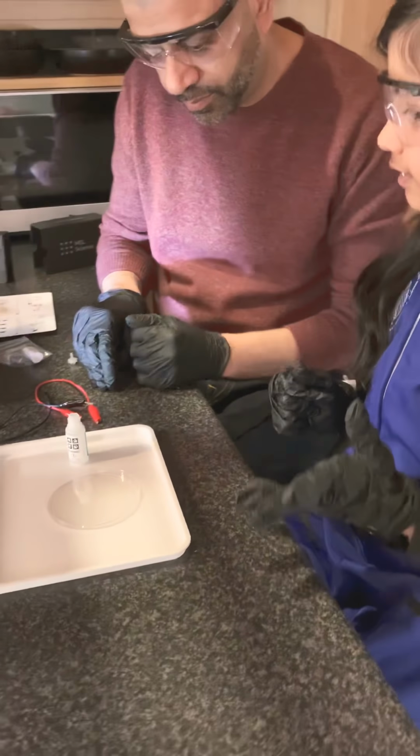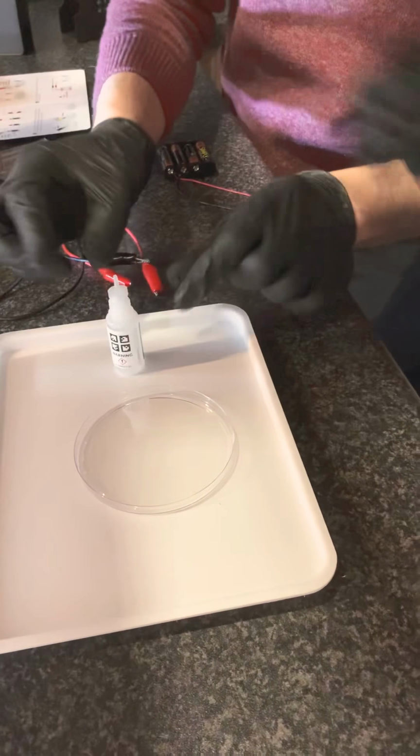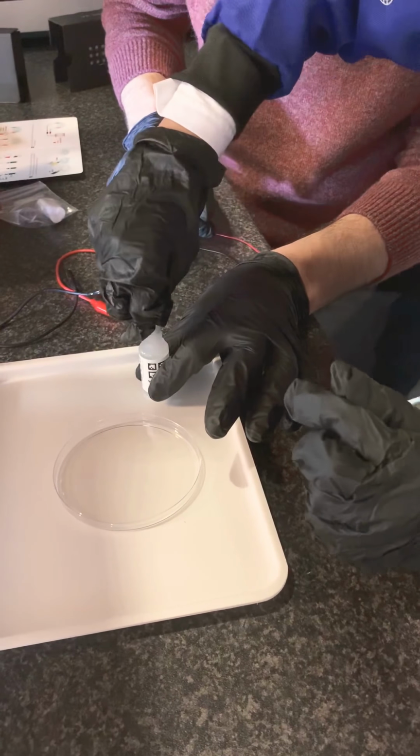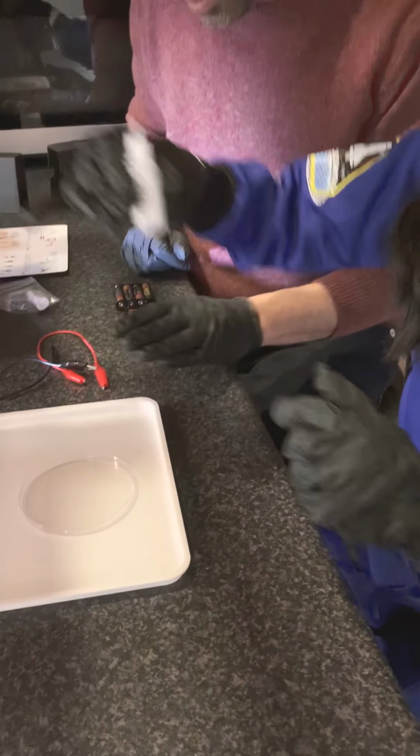Now you need to insert the nozzle securely into the SnCl2 bottle. So far it should be like this. Okay, good. That's it.